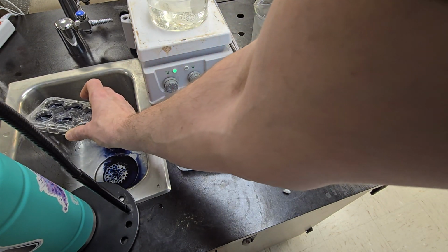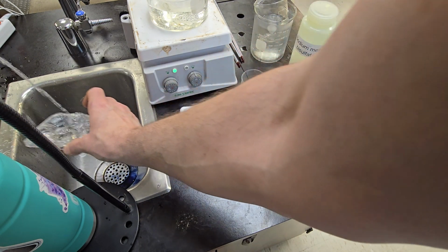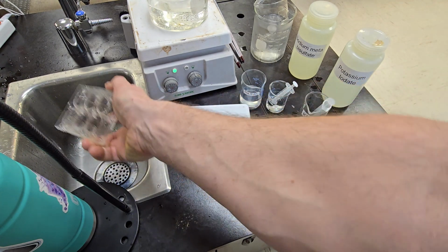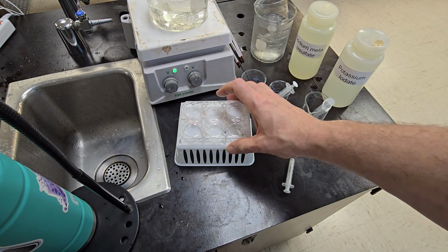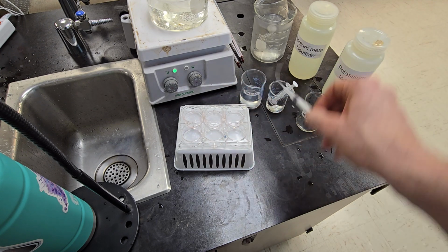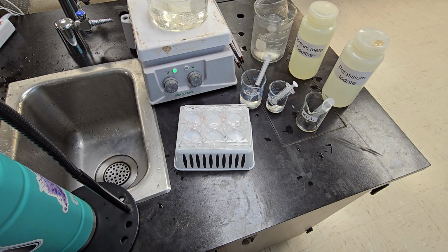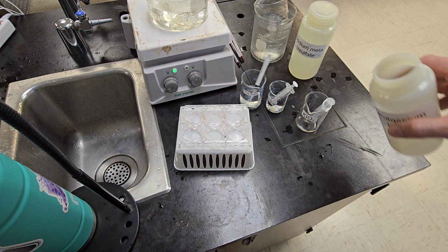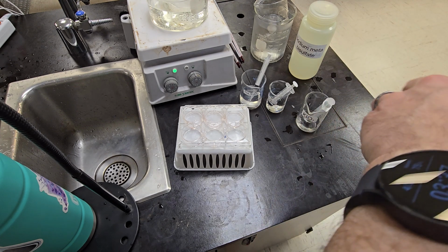And we flip to the back page and we do a slightly different experiment. On the front page, we change the concentration. On the back page, we are changing the temperature. We are still using 2 milliliters of sodium metabisulfate every time. We're using 3 milliliters of potassium iodate. 3 of those milliliters are room temperature.